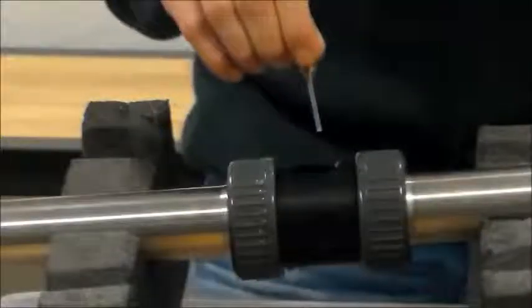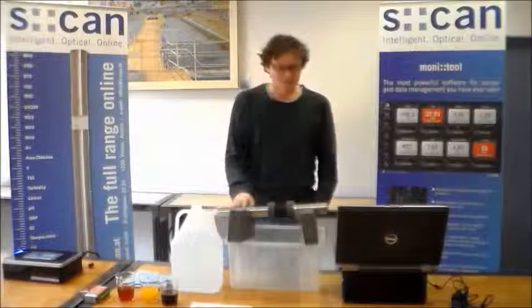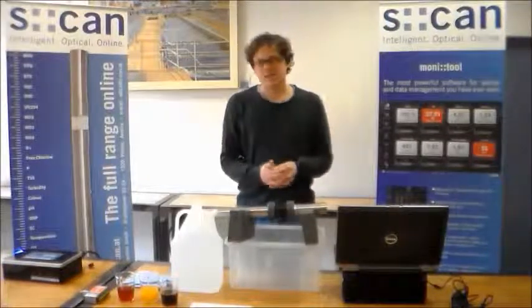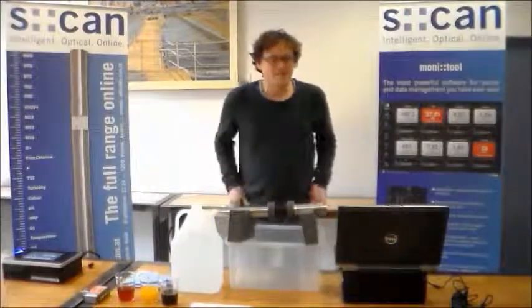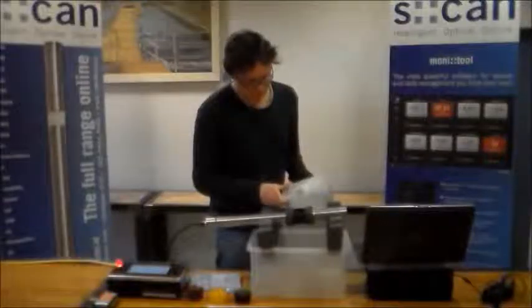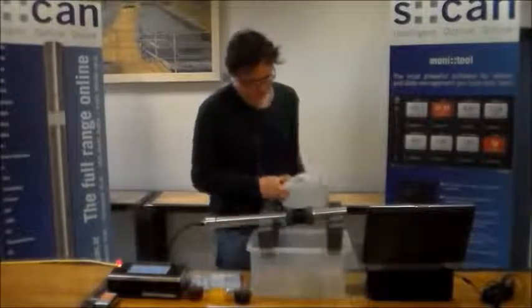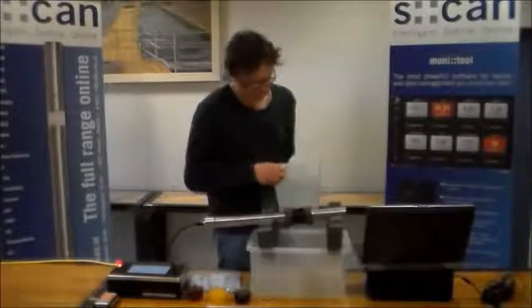I will start with a contamination with coffee. In this case, I expect to get an alarm because we did confirm the coffee event and we did only reject the orange event. So coffee should still trigger an alarm. The coffee, as expected, triggered an alarm, and before the next measurement is done, I will replace the water in the reference slide in order to stop the alarm.